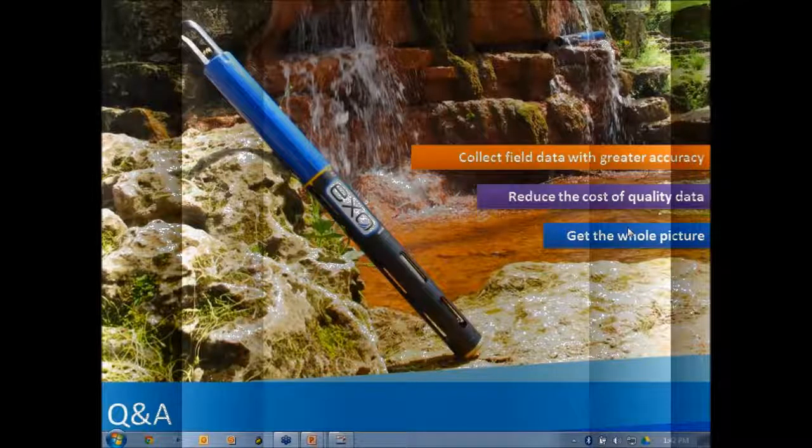And when we developed that, we did that intentionally. This was because at the cellular level, when you're looking at our fluorescence sensor, there was so much noise. So we decided to not include that in the new version. But if you are interested in still having these units, you can convert them if you establish a relationship between the sensor's fluorescence and the algal cells per milliliter unit in a post-process step.